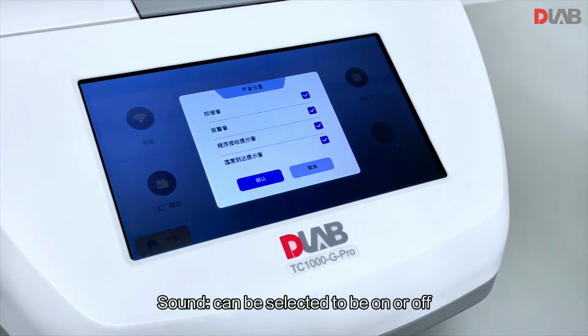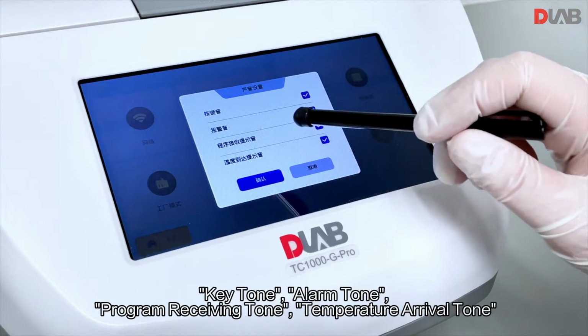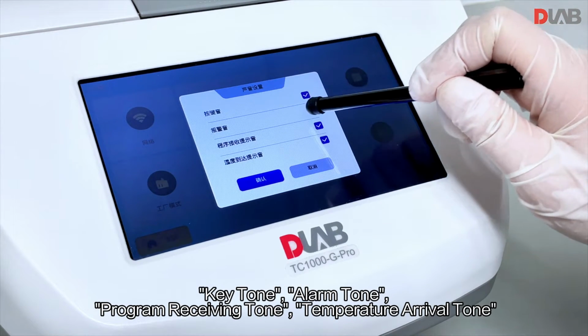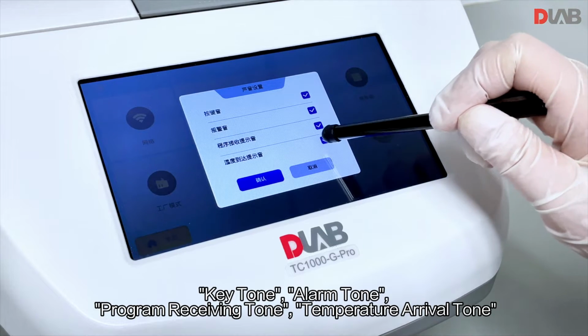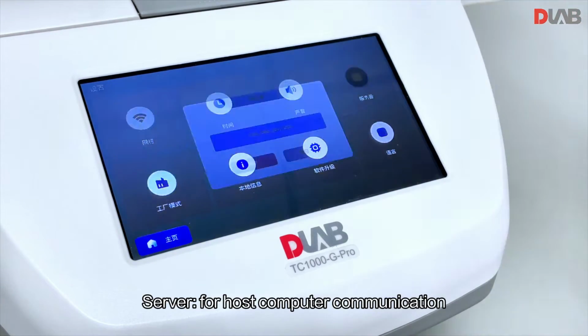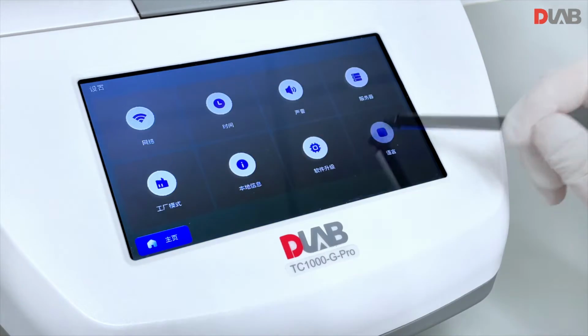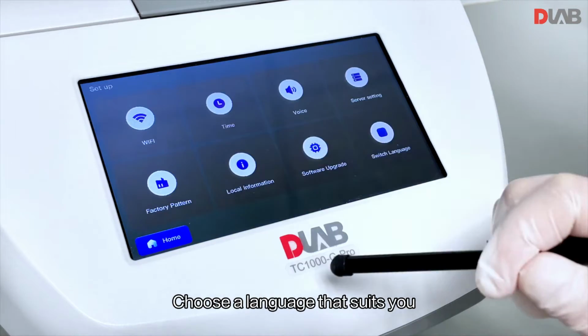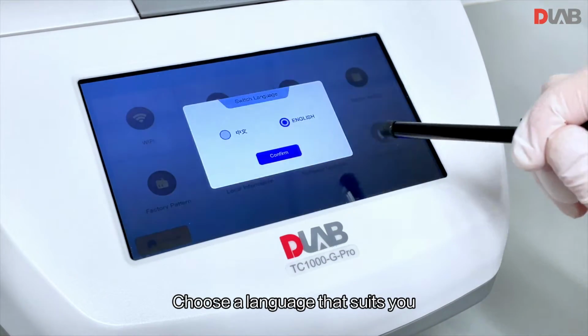Sound can be selected to be on or off: key tone, alarm tone, program receiving tone, temperature arrival tone. Server, for host computer communication. Language: users can choose between Chinese and English. Choose a language that suits you.